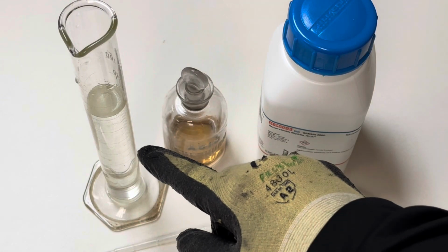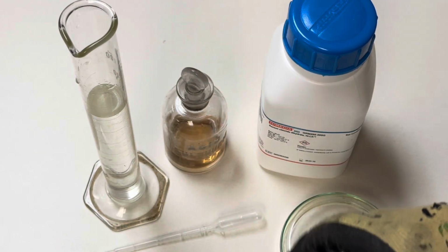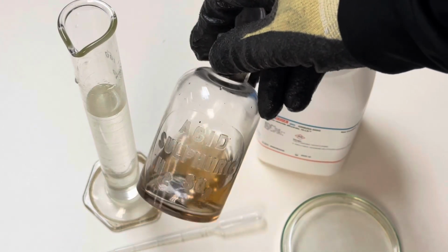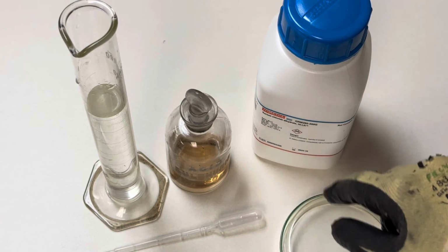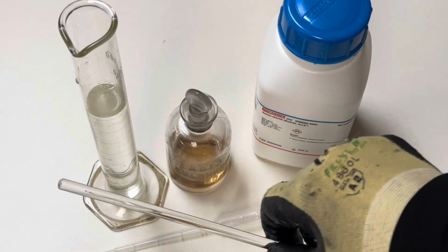Check this out. For this reaction, I'm using 80 milliliters of distilled water in a graduated cylinder, 18 molar sulfuric acid, barium chloride, a petri dish, a dropper, and a glass stir rod.